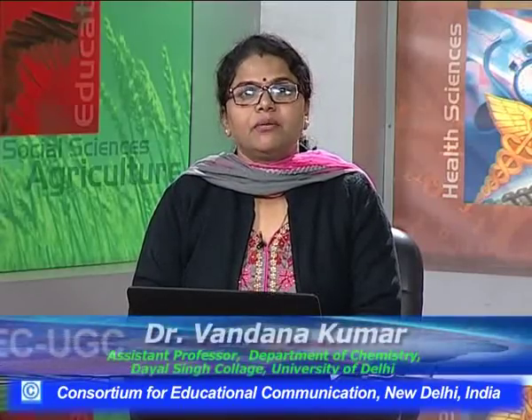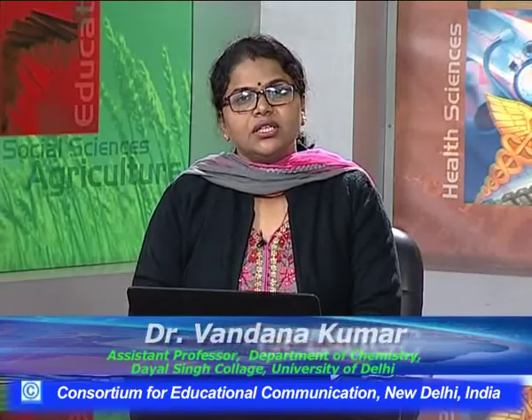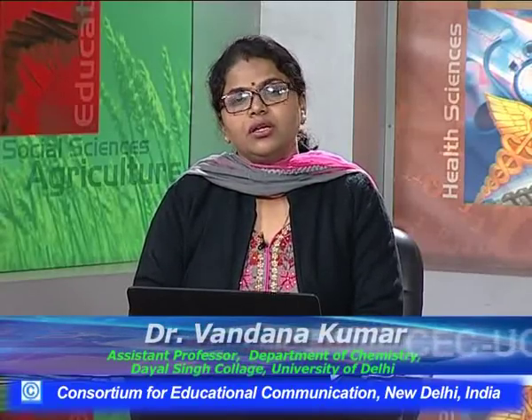Hello viewers, in this series we have discussed various lectures regarding spectroscopy. We have discussed in detail UV visible spectroscopy, NMR spectroscopy, and then IR spectroscopy. We have discussed mass spectroscopy also, and in today's lecture we will take some organic molecules and their fragmentation patterns, how they fragment and give different fragments.